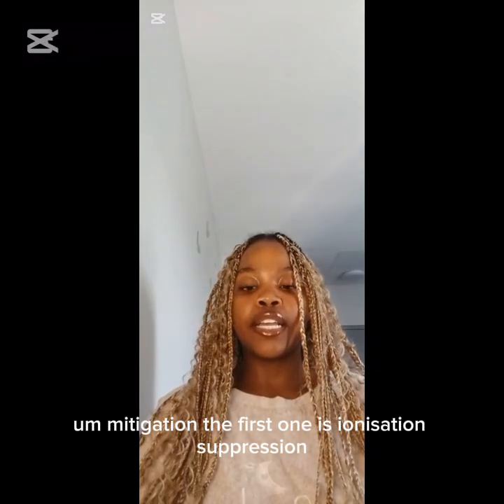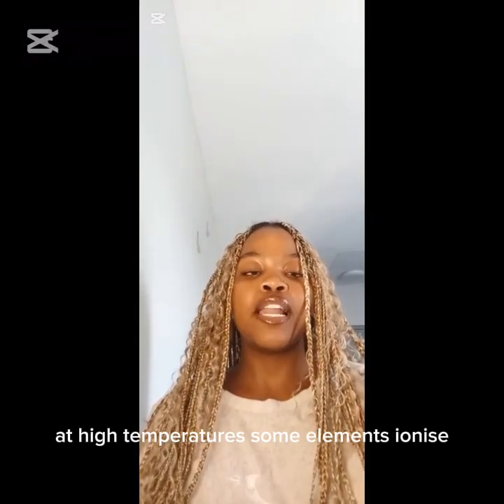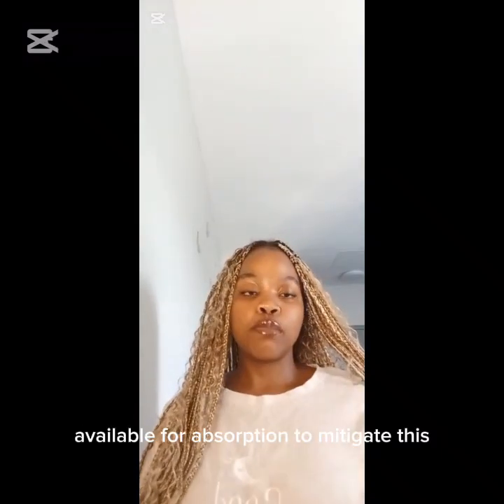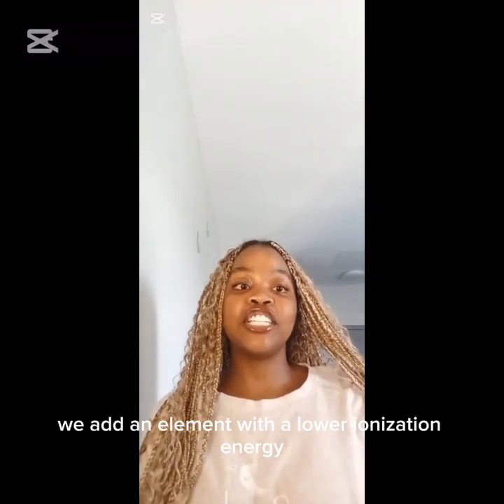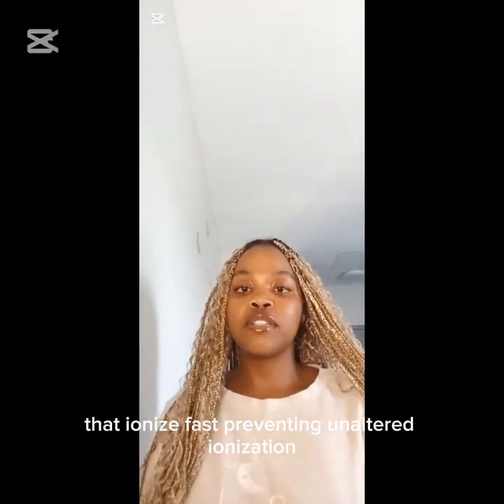And now we come to non-spectral interferences mitigation. The first one is ionization suppression. At high temperatures, some elements ionize, reducing the number of neutral atoms available for absorption. To mitigate this, we add an element with a lower ionization energy that ionizes fast, preventing analyte ionization.